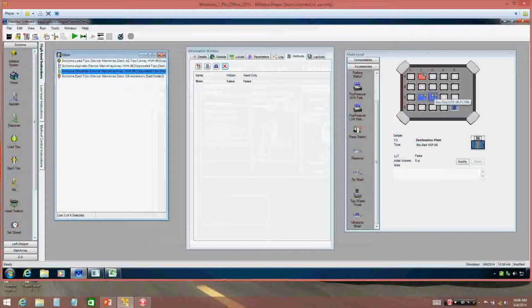So, there is a feature though, if you did want to get fancy and create a unique user experience. What you could do is create startup interfaces, very similar to what I showed you in our next-gen sequencing automation software. This is something that I've worked with a lot on liquid handlers in the past, and this feature is one of my favorite things. If you do want to do any coding in the background, again, you don't need to if you don't want to, because you can completely write a whole entire application without any programming. But if you wanted to add a very fancy effect to it, you can.